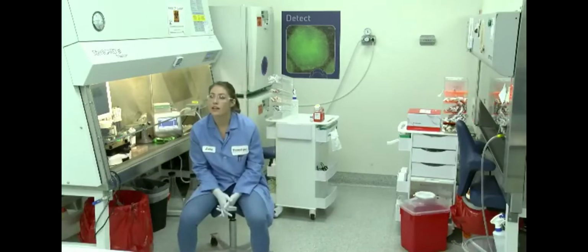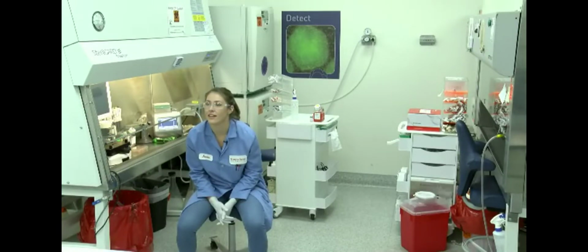All right. A follow-up question on that was whether you could reuse these tips multiple times for multiple electroporations? Just as with any pipette tip, it's not recommended that you reuse a tip because you could cause cross-contamination. But in an instance where you might be doing duplicate transfections, you actually can reuse a tip. But it's not recommended that you use a Neon tip more than 2 times in a row, because the electroporation can cause thinning of the coating on the electrode of the tip, and this can mess with the conductivity of the tip and affect your transfections accordingly.